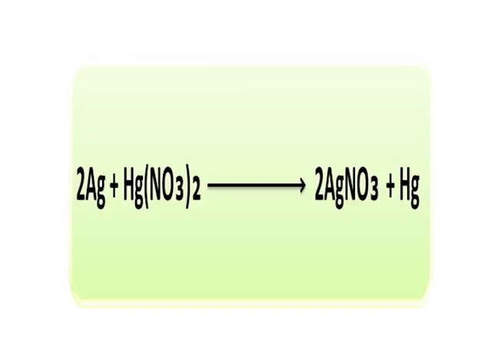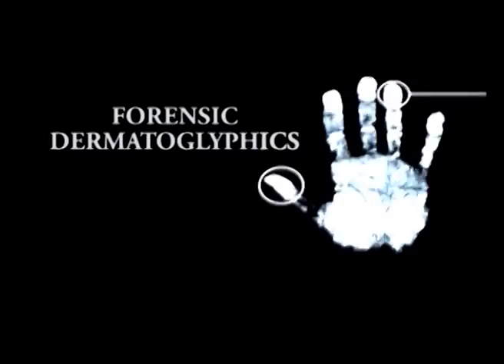As the silver ions absorbed into the body of the substrate are transformed into metallic silver, the mercuric nitrate reverses the reaction. That is, the metallic silver which would have stained the background is reconverted to soluble silver nitrate, which is subsequently drained off. The reaction involved in this procedure has been depicted on your screen.